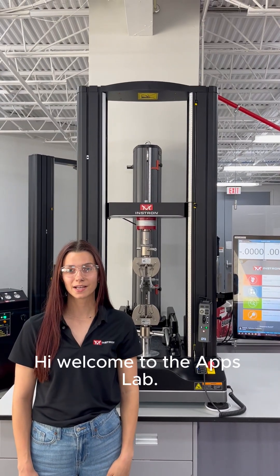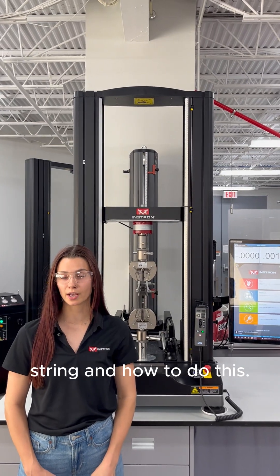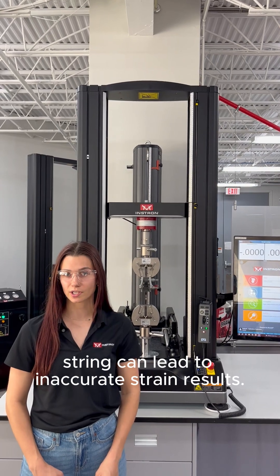Hi, welcome to the Apps Lab. Today we're going to be talking about how important it is to remove the compliance from a load string and how to do this. Compliance in a load string can lead to inaccurate strain results.